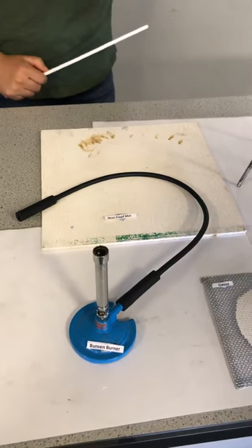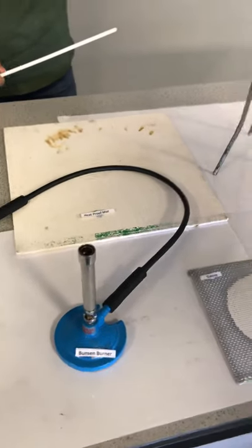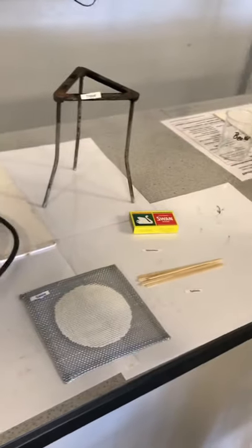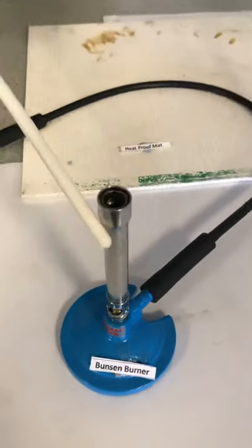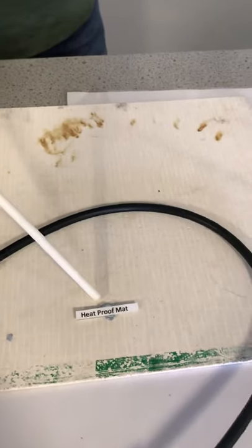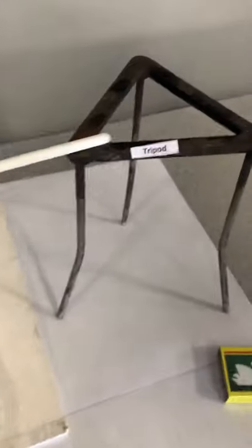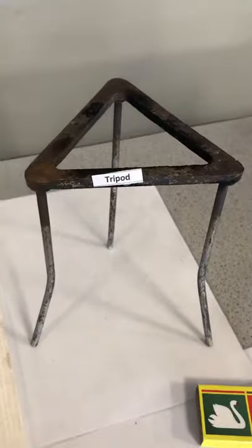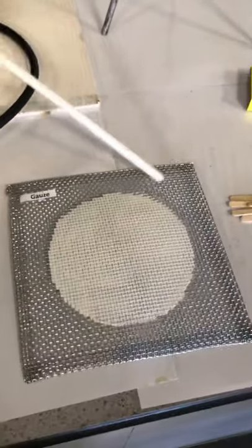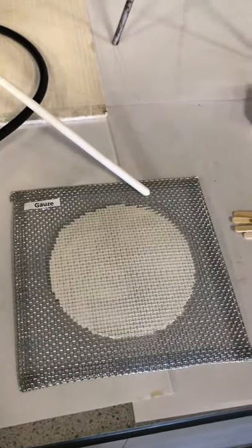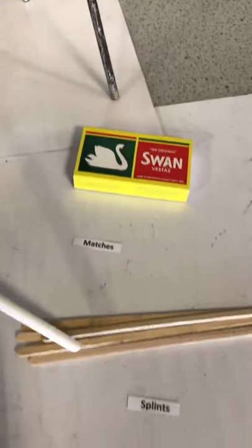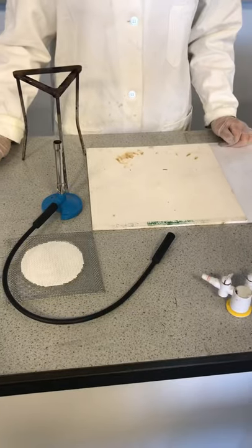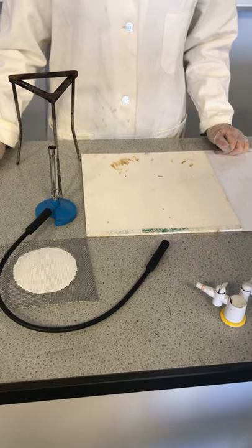Let's start the experiment. Step one: collect all the heating equipment required to do this experiment. We need a Bunsen burner, a heatproof mat, a tripod, ceramic gauze. We also need a matchbox and some wooden splints.